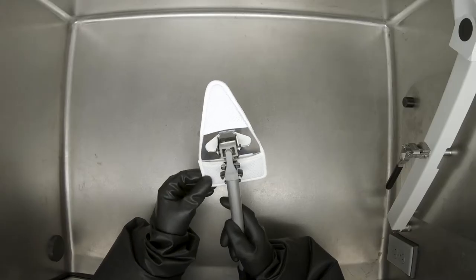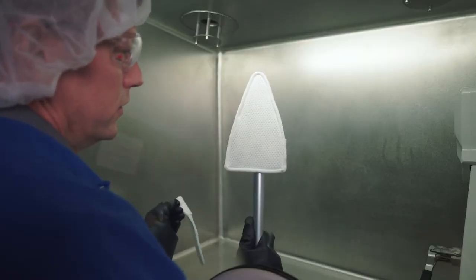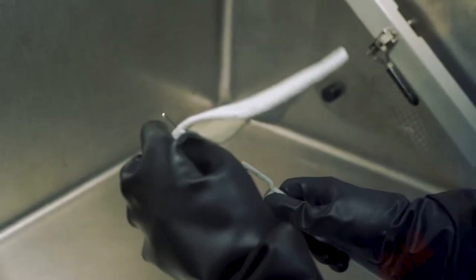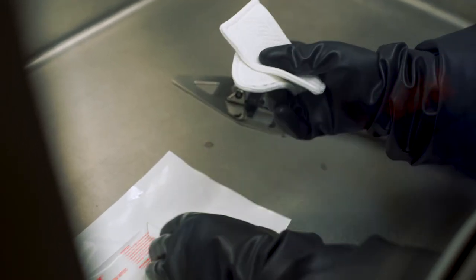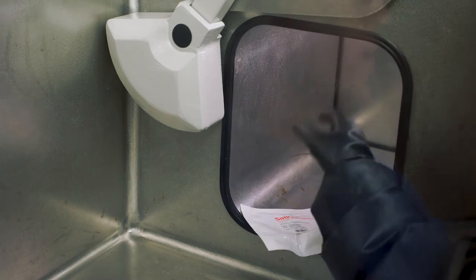Lock and unlock the 360-degree feature as needed for proper head angle and reach. Change the padded cover for each section. Place the used covers, wipes, and swabs in a disposable bag and place in the pass-through for disposal in an approved waste container.